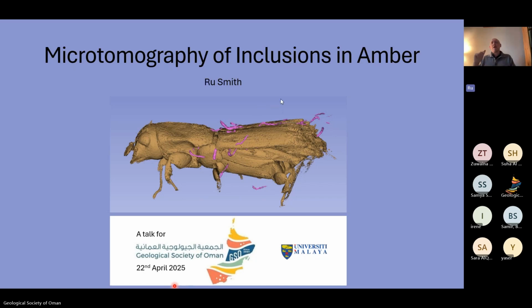It might be, this is only a vague memory now, but certainly the French Lower Cretaceous amber was nearly opaque. So they used this same technique of an X-ray microscope to image the inclusions because they couldn't see them optically. So that's when this technique becomes very, very powerful indeed. You need it. Otherwise, you don't know what's in there. And yes, the Spanish occurrences, I don't know. I'll have a browse after this. I'll have a quick search and see what I can find.